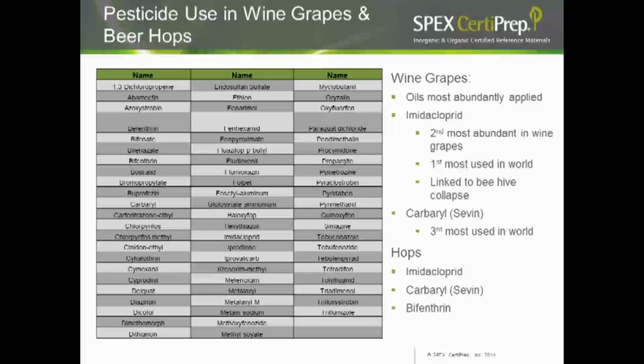When we're looking to extract our agricultural products, we have many means open to us. We have our traditional methods of Soxhlet and supercritical fluid extraction. We also have our microwave extraction. But every method has its issue. You have your contamination issues, your poor recovery issues. Some of these methods use tremendous amounts of solvent, which creates waste. You also have specialized cartridges and equipment for things like SPME or SPE. You sometimes also have high volumes of samples that have to be used to do a proper extraction.